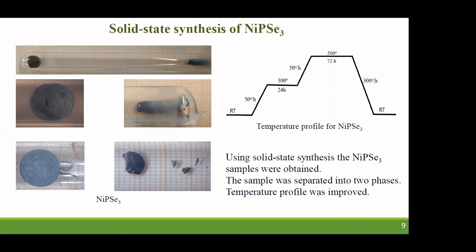So we decided to improve the temperature profile and to lower the highest temperature to 500 degrees. And here you can see the sample that was obtained using this improved temperature profile, and after powder X-ray diffraction, we understood that it was better.